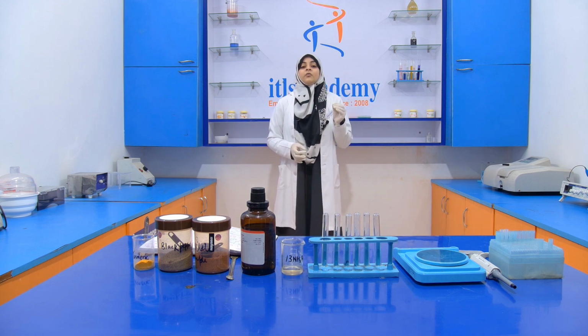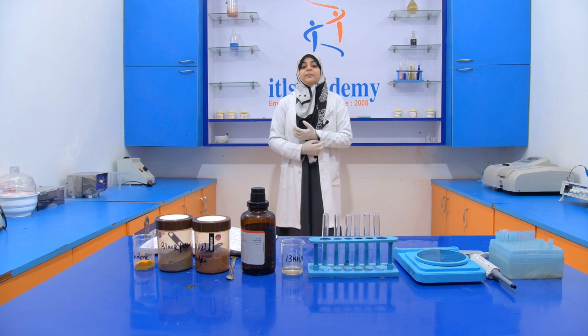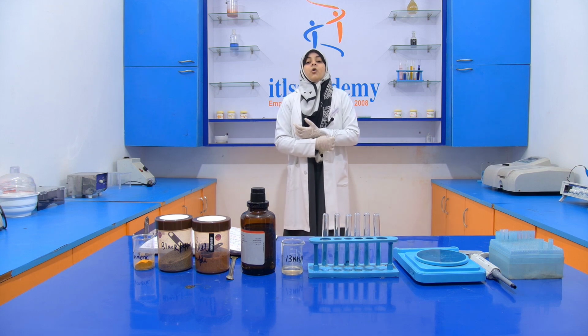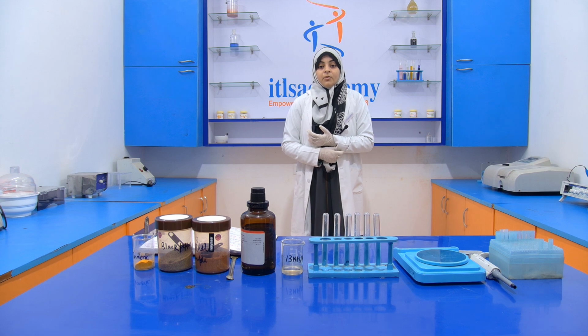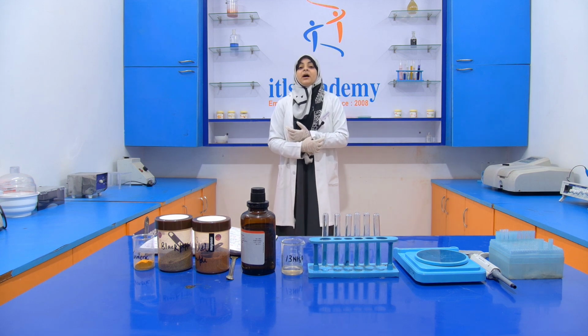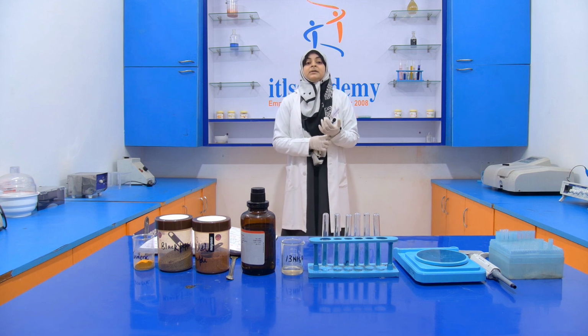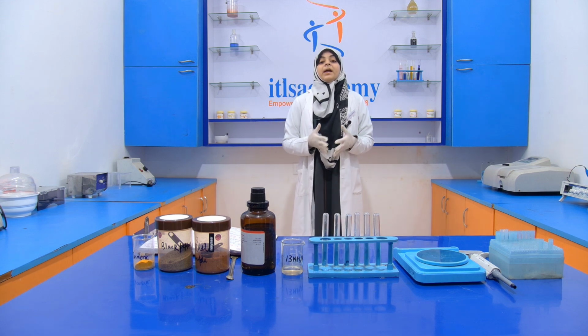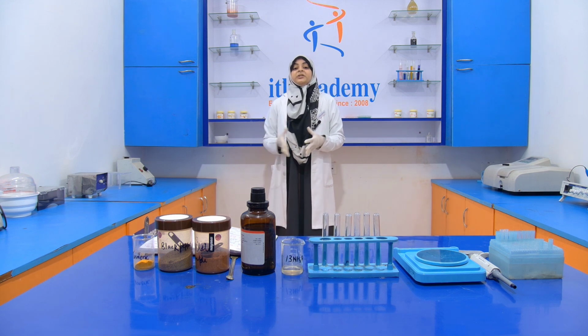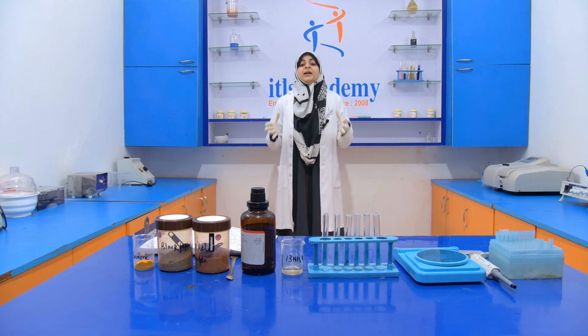Sometimes even the nutritional value of the food product decreases. That's why the addition of an adulterant is prohibited, and the chemical substance which is added during the adulteration is known as the adulterant.